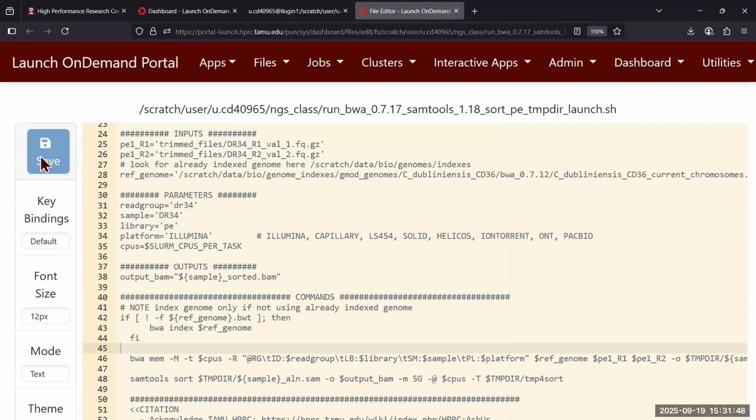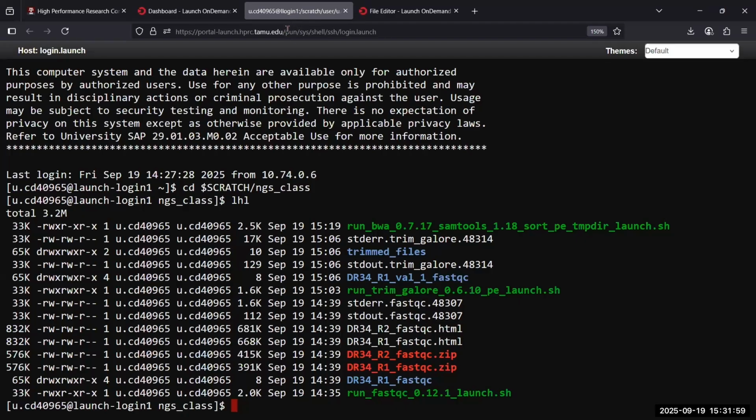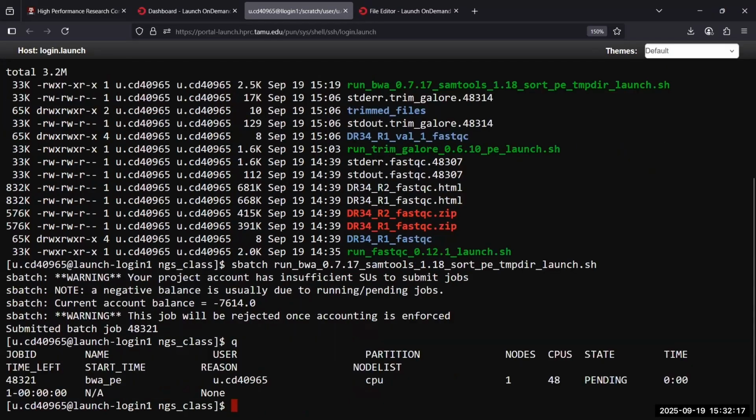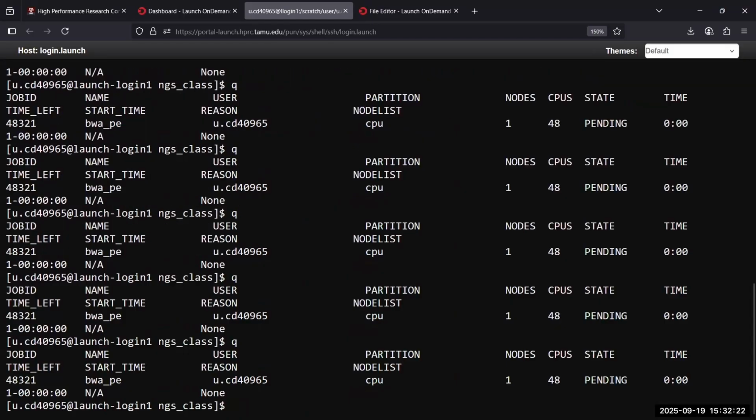Yeah, okay, when you're ready and you saved it, let's go back and submit the job script. So see what I'm doing? SBA tab, RU tab, B tab. Submit that job script. And then hit Q so you can see it's pending. It's probably going to start running a little bit. But while that's running, I think this one takes maybe 2 minutes. Okay, now it's running.